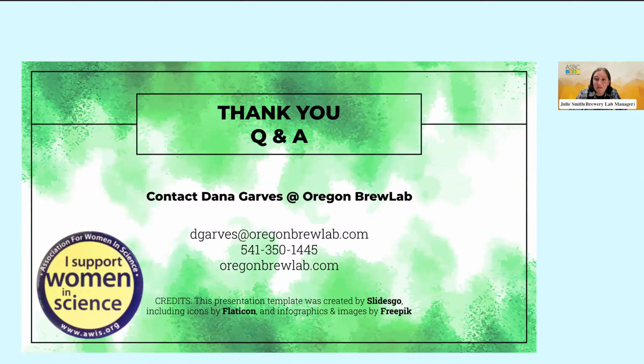Let's see. Lee had some issues when reclaiming and filtering isooctane with the product. After filtering, it was reading negative IBUs when compared to the stock solution. Do you have any suggestions for troubleshooting that? I would look at maybe what you're packing the column with, and maybe revamping some of those ratios. But it is actually not something I do.